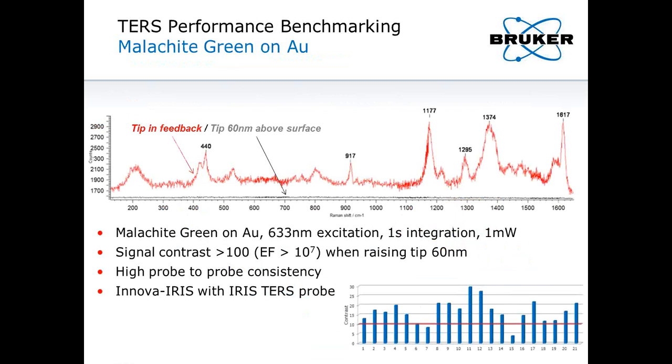And of course, at each point, you may get a full spectrum. Those peaks, the vibrational frequencies of the molecules, are a signature or fingerprint of the molecule, so you'll know which chemicals are right underneath the tip.